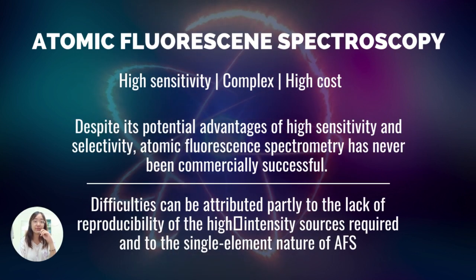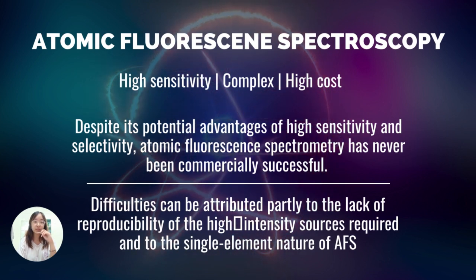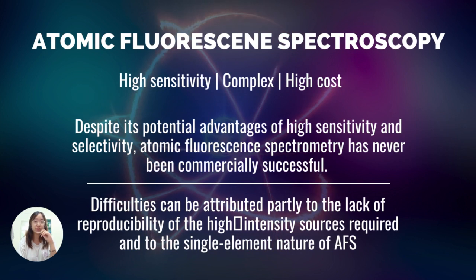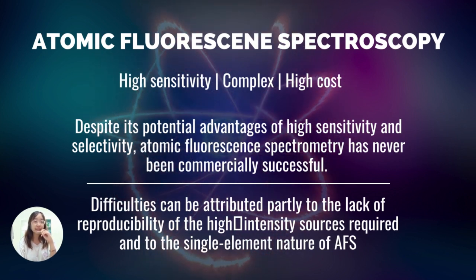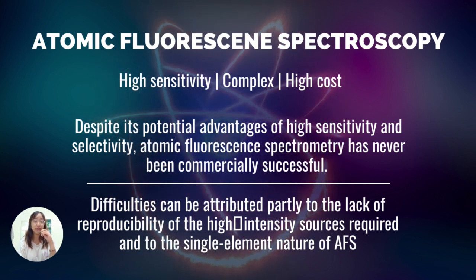Despite its potential advantages of high sensitivity and selectivity, atomic fluorescence spectrometry has never been commercially successful. Difficulties can be attributed partly to the lack of reproducibility of the high-intensity source required and to the single element nature of AFS.